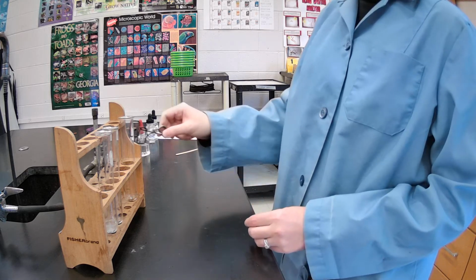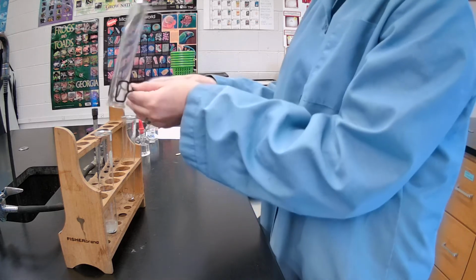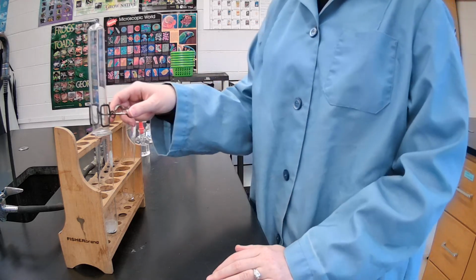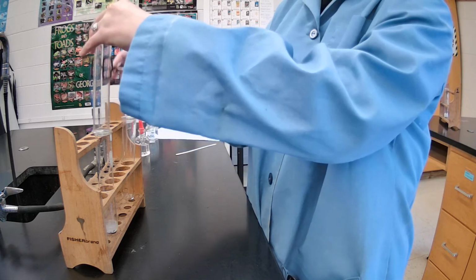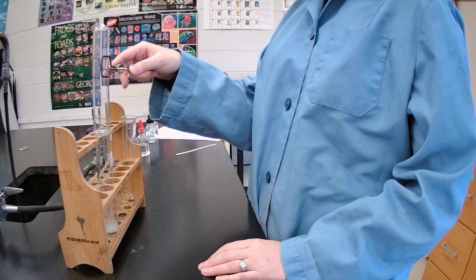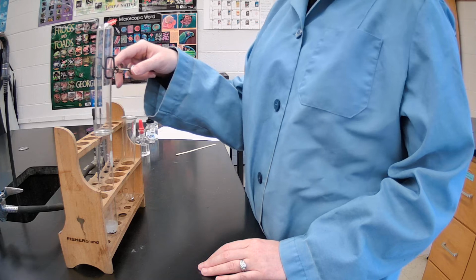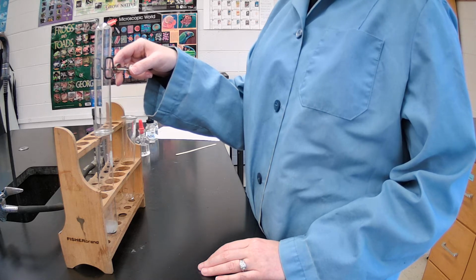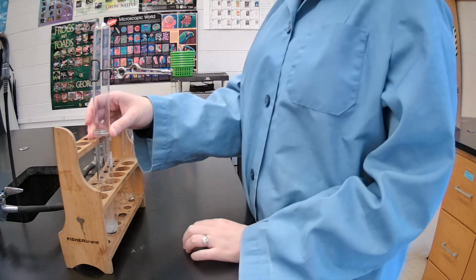So I'm going to take this empty test tube and hold it over top of this. I am trying to catch that gas that is being produced from those bubbles. I'm going to sit here and catch my gas for a little bit. So let's wait. Now you notice I'm getting a good seal on my gas because I don't want any of it escaping.